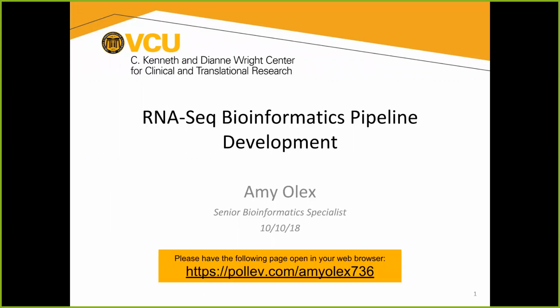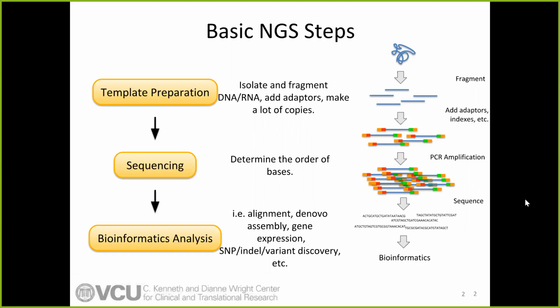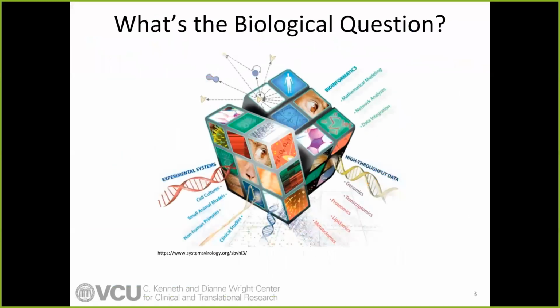So while everyone is looking at that, just to review, this is just the basic next generation sequencing pipeline. When I spoke 2 weeks ago, we talked about template preparation a bit and the actual sequencing. Today we're going to be talking about the bioinformatics analysis.